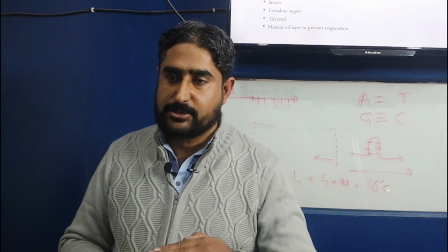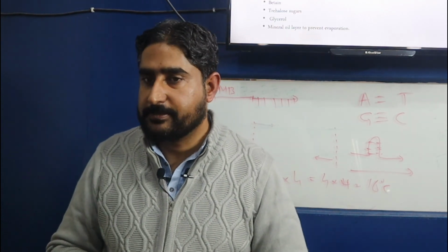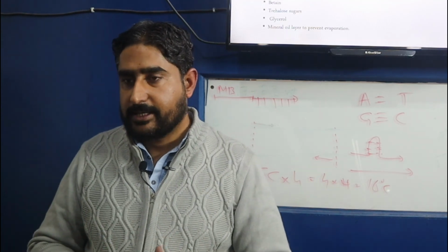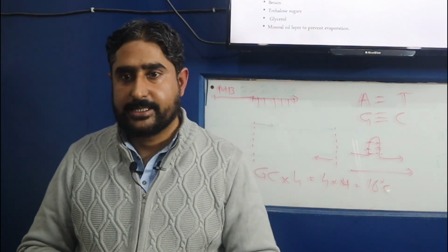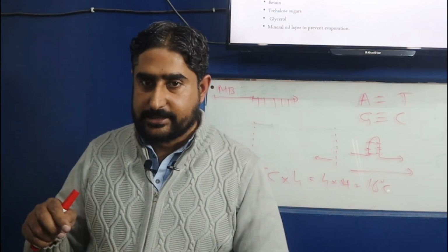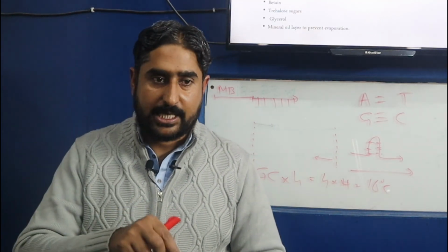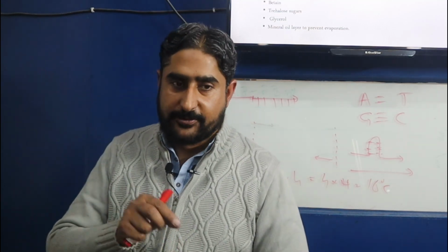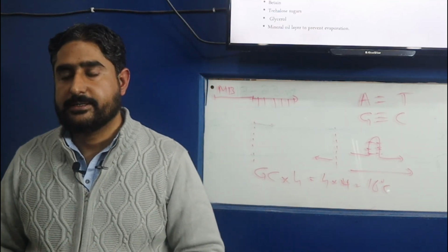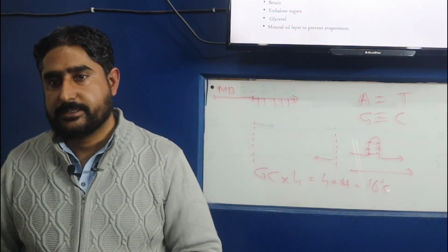So in that situation, when we have to stop non-specific amplification at room temperature, we might need to go for hot start PCR, in which we prepare our master mix on ice, at low temperature, and then we start the thermocycler. The temperature of the thermal block is 94 or 96 degrees centigrade, and we directly transfer our PCR tubes or PCR plate from ice directly to 96 degrees centigrade for specific annealing of the primers to their respective loci. That's called hot start PCR.